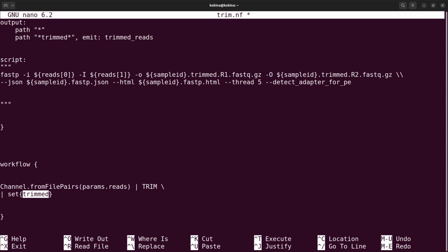And when we assign it, then we can pick the outputs there and then process them. Basically, that's how I'm going to explain it as well. Those who also have other explanations, please put them in the discussion box. All right, so this is what we have.